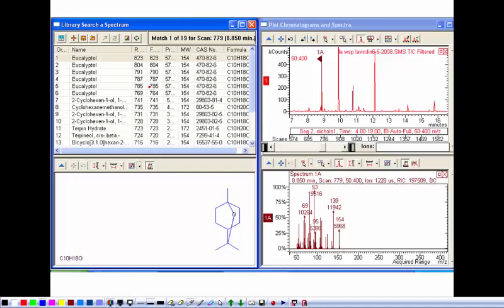I mean, most of this is pretty straightforward. Somebody gave Dr. Weiner last year a small sample of what looked like an amber resin, and he didn't know what it was. He wouldn't tell me where it came from. It was super secret until we were done with it. So we dissolved it, put it in the mass spectrometer, and started looking at some of the components that came out, and they were components that were in resins, varnishes, and wood products, like wood polish and pine things.